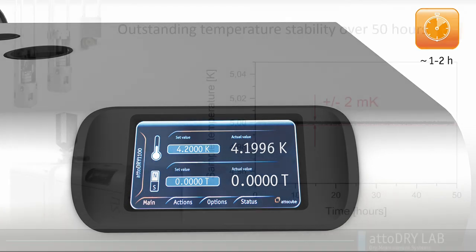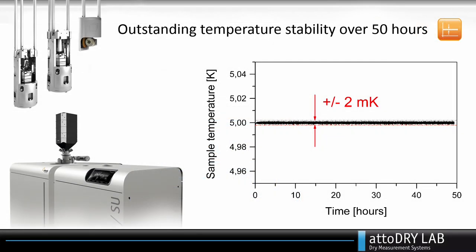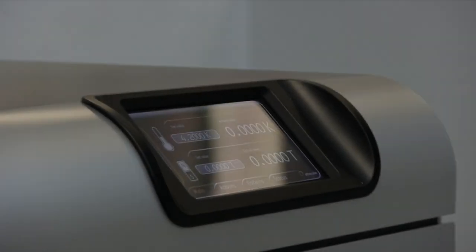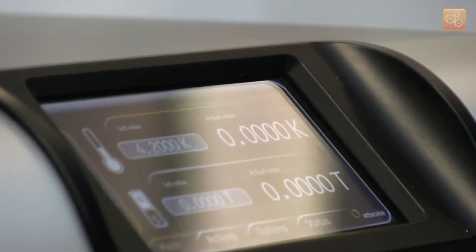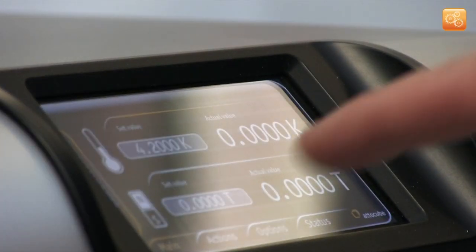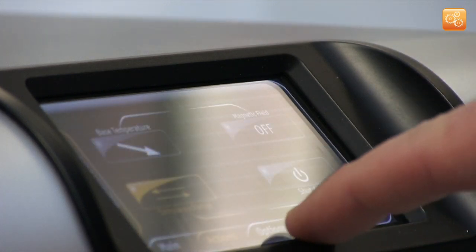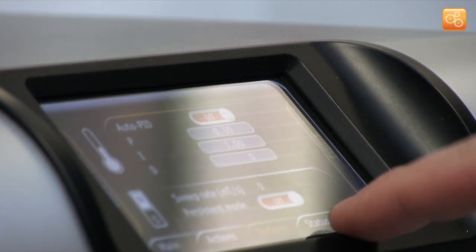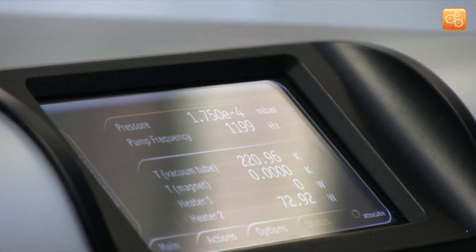At the same time, the temperature stability was measured to be better than plus minus two millikelvin over 50 hours at base temperature. The integrated touchscreen provides an intuitive interface to set field and temperature, hence enabling a true set-and-forget type of operation.